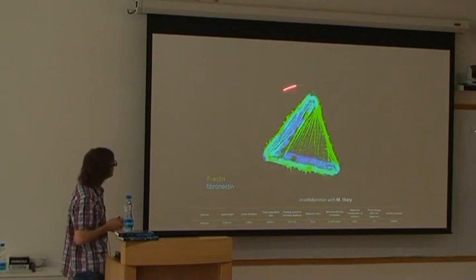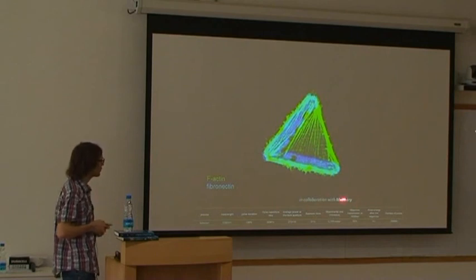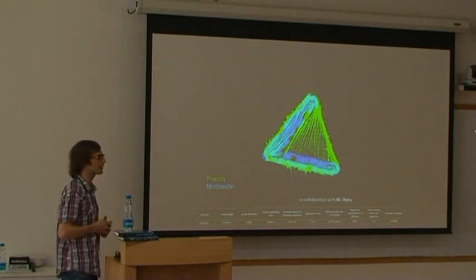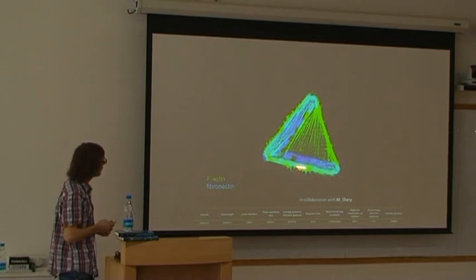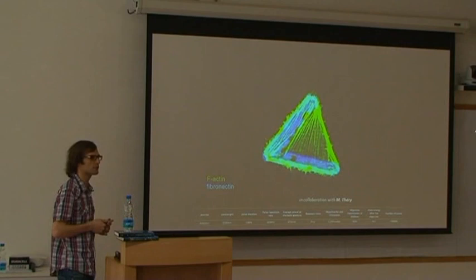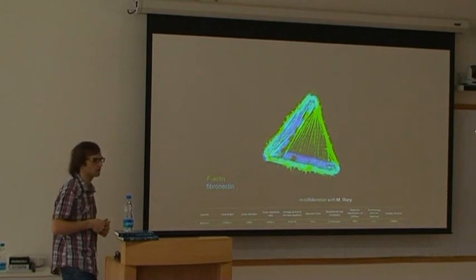Okay, this experiment is another one. I did this at the time, I think in 2007, in collaboration with Thierry, who came to my lab when I was doing my PhD, and he asked me, Matteo, can you try to do something with these cells? Because I'm creating micropatterns with a laser. So he creates a pattern that has adhesive properties of fibronectin, so cells can spread and adhere on this. Depending on the shape he creates, the cell will make different shapes and also create different cables of fiber actin. So he asked me to try to test different types of cables, inside and outside cables.